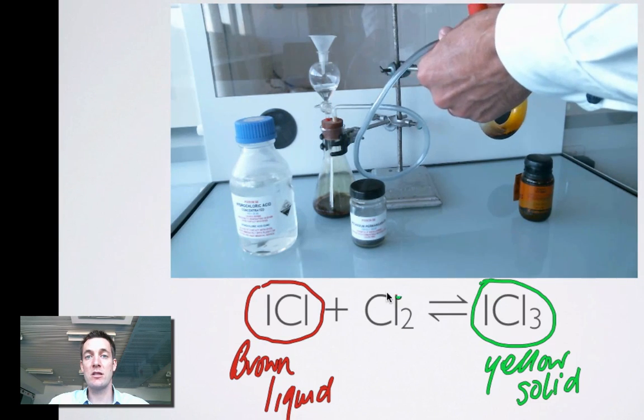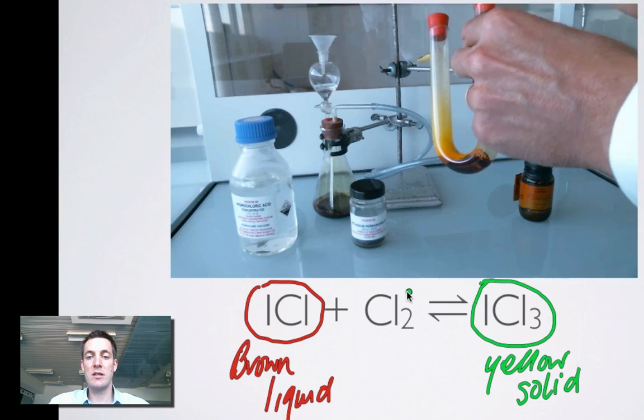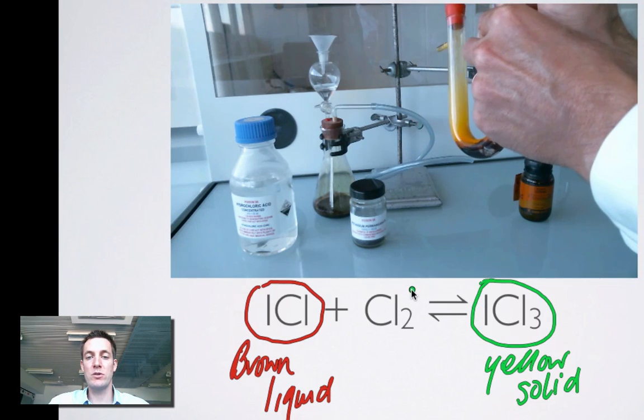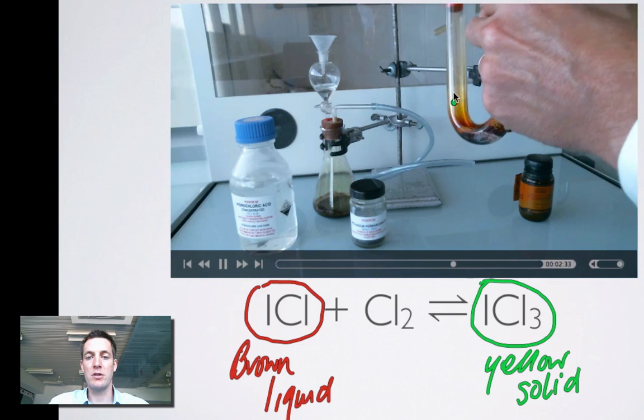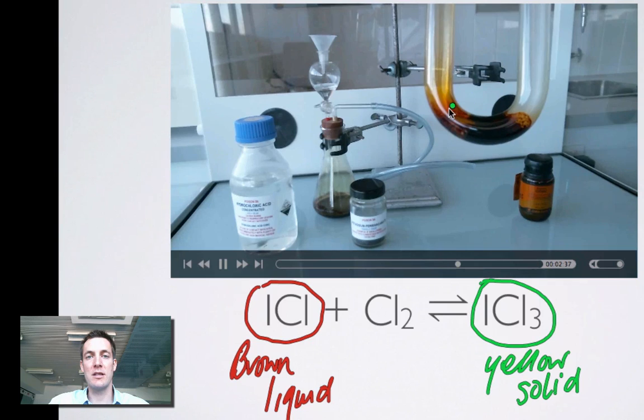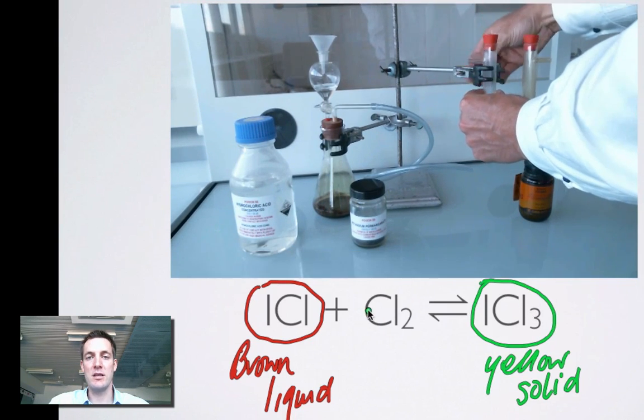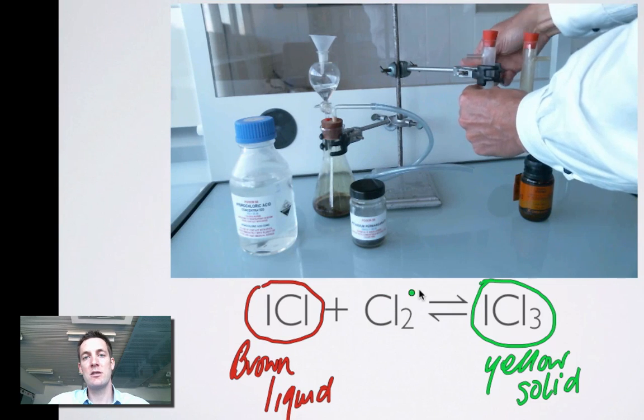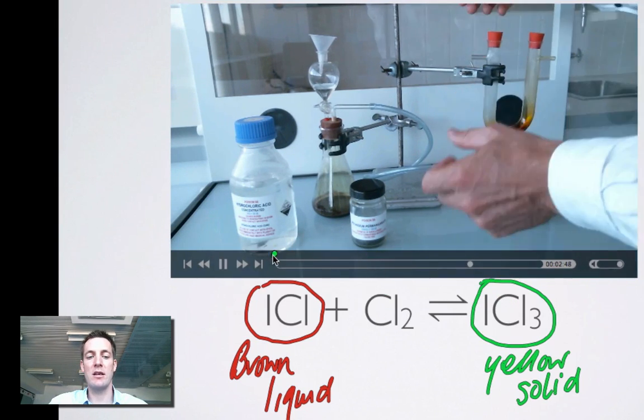In other words, it looks like this equilibrium is using up the stuff that we're adding. Here once again, we're just going to remove the chlorine. So we're going to blow through the tube. Simply blowing the chlorine out of that tube and you can see that yellow solid disappearing there and turning back into that brown liquid. So once again, remove chlorine, the system replaces it. Add chlorine, the system removes it. So we've seen those changes happening there in that system.